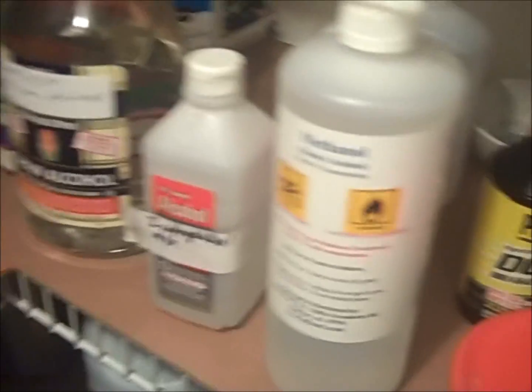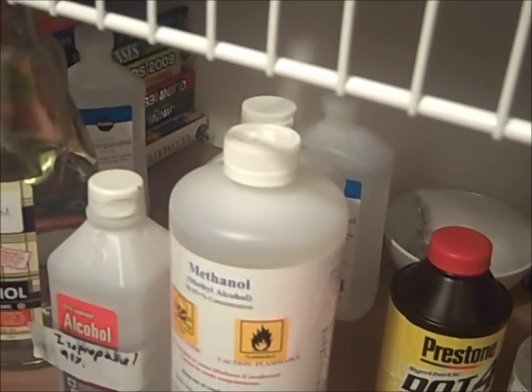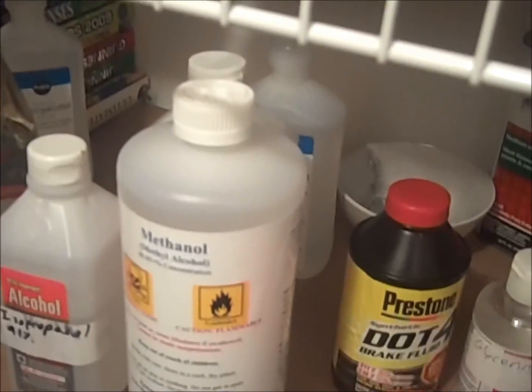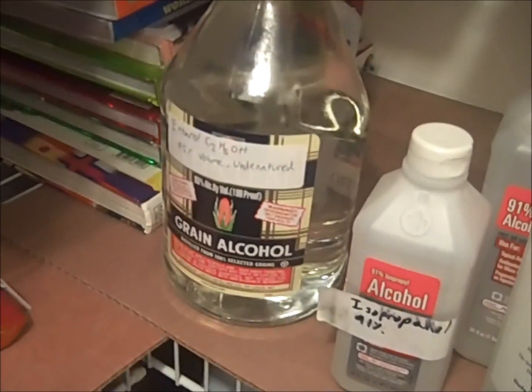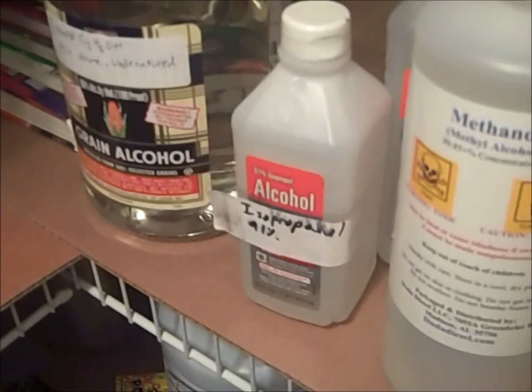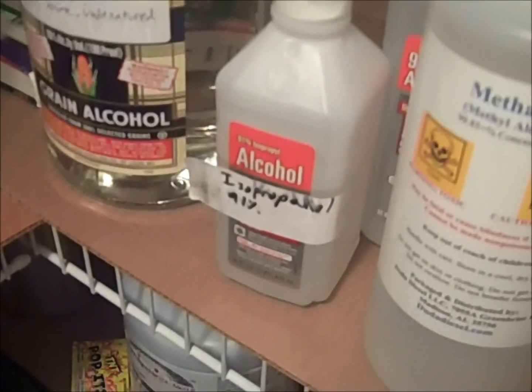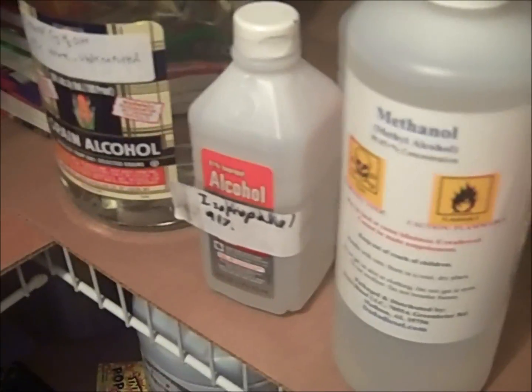My alcohols include methanol, ethanol, and isopropanol. Methanol can generally only be purchased online in pure form, although it is contained in windshield wiper fluid and other similar things as a denaturant. This is Everclear, which can be purchased from alcohol stores at a rather hefty cost. It is pure ethanol. This is isopropanol, which can be sold at pharmacies. It is sold as a disinfectant, and it is sold in 70 and 91 percent concentrations.